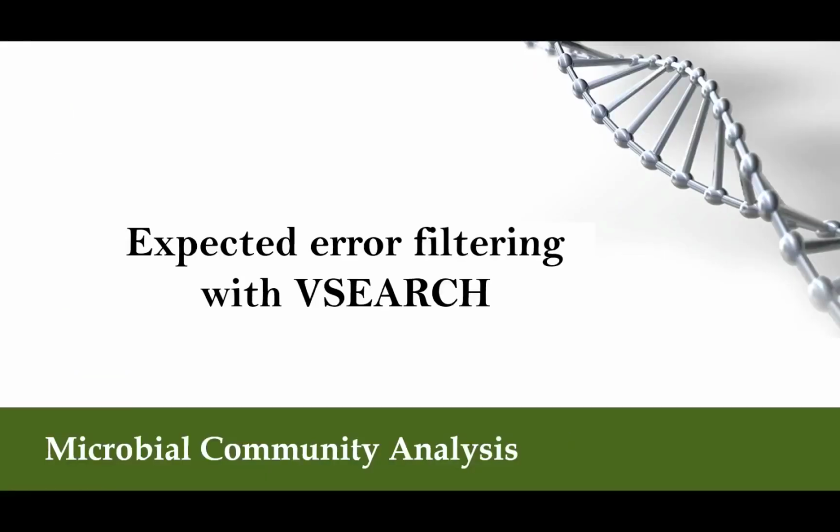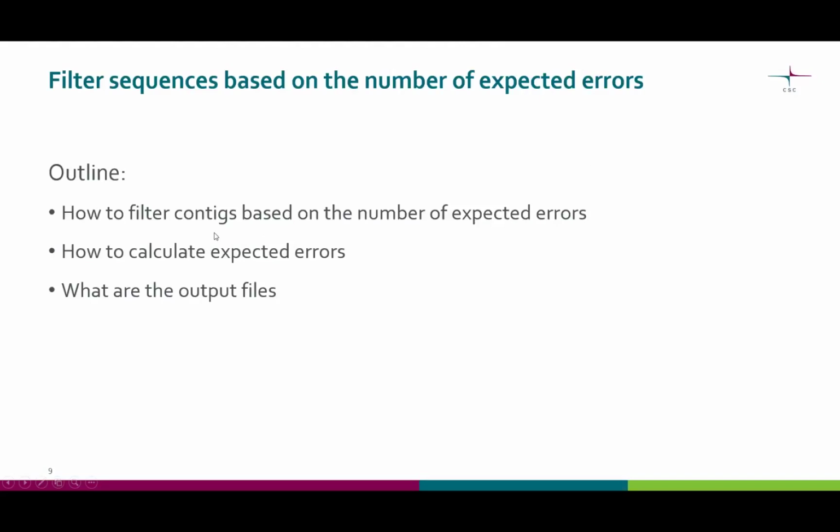In this video, we discussed how to filter contigs made by VSEARCH based on the expected number of errors. So you learned how to filter contigs, how the expected errors are calculated, and what the output files are.